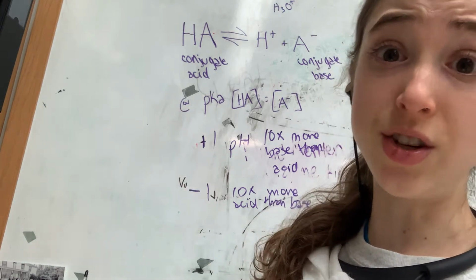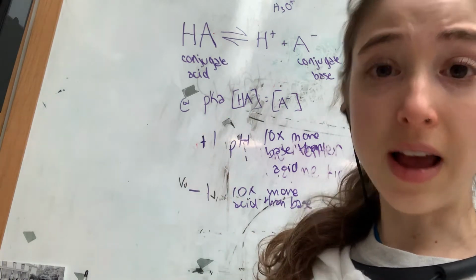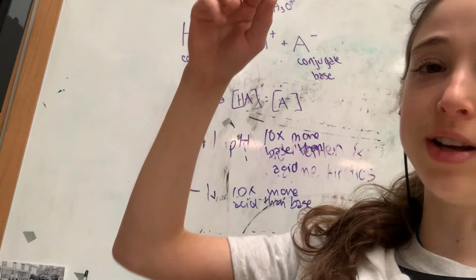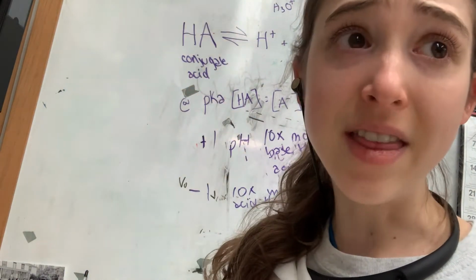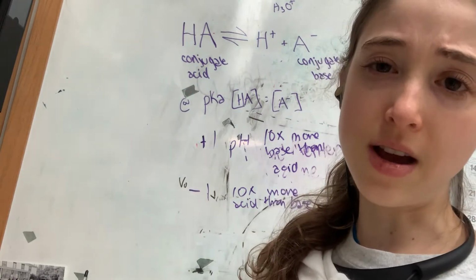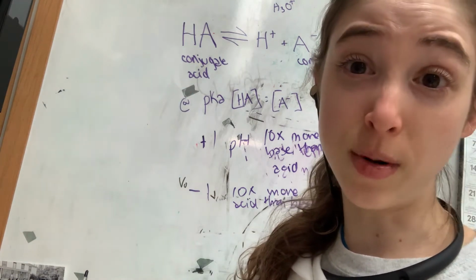But you don't want to have to adjust the pH too far, because then you're adding in a bunch of external ions, all those salt molecules, especially if you're overshooting it. So you're adding HCl and then you're adding NaOH, and now you've added salt, and now your solution's super salty. There's this thing called ionic strength, which has to do with how many ions or charged particles are in a solution.